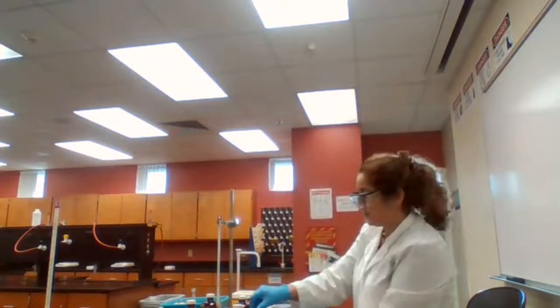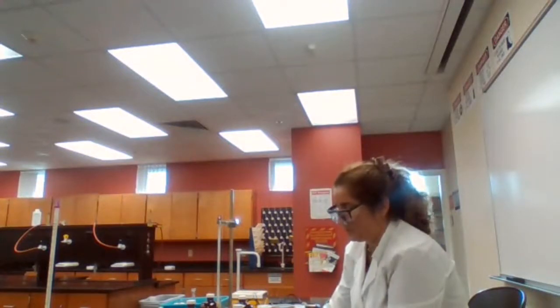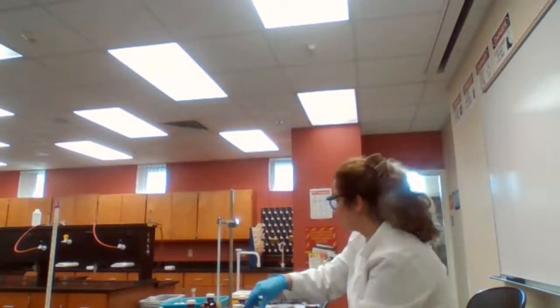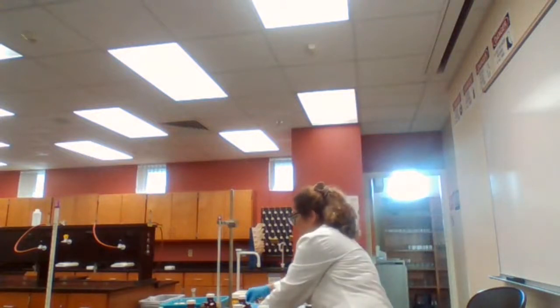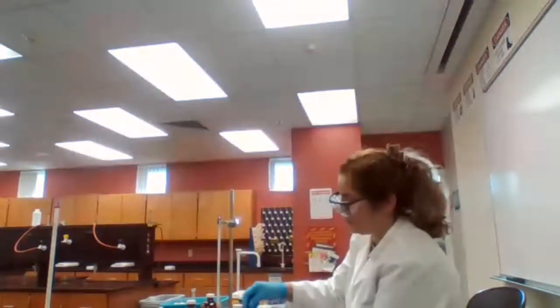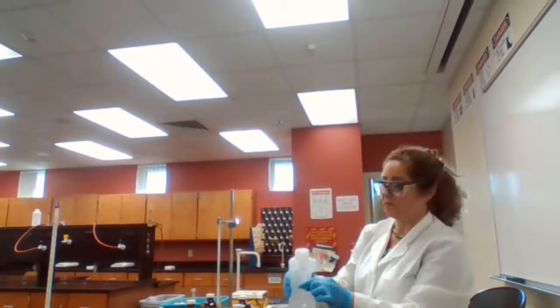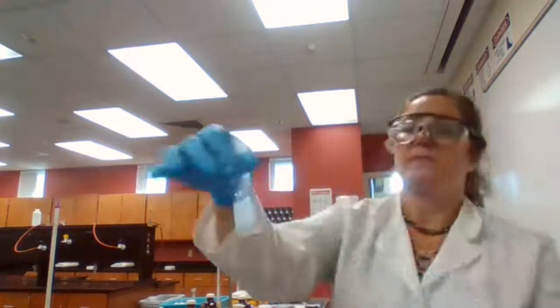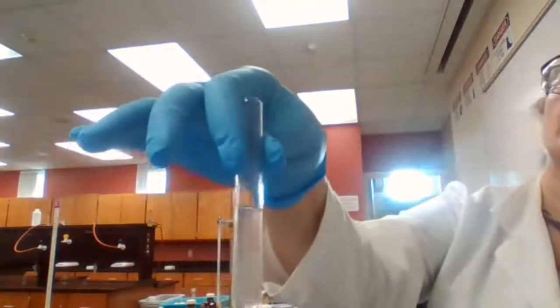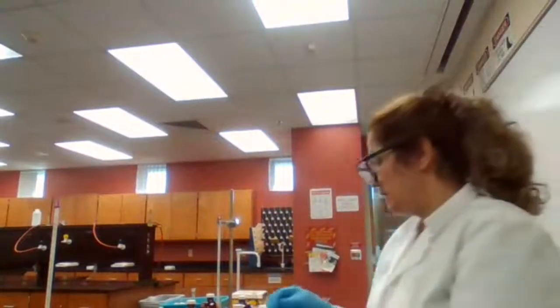Test tube was not clear. Okay, that's ethanol and what? One layer or two layers? One layer, so it is soluble, okay? Because you have one layer, it would be soluble.